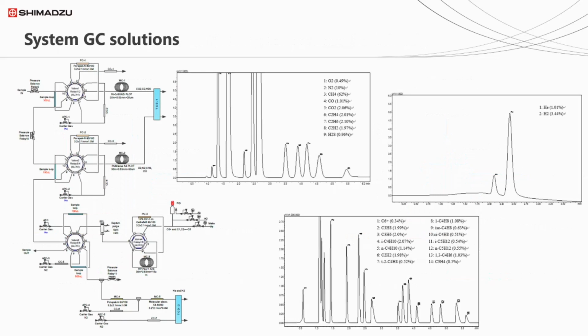If you thought that was complicated, many systems are unfortunately far more complicated than a single valve system. Some can have 2 or even 4 valves to fully separate and analyse the full range of analytes that are required for the method. This is particularly true in the hydrocarbon processing industry, where analytes from hydrogen all the way up to double-digit carbon numbers need to be quantified in a single analysis. Here's an example of a pretty extreme system that has 4 valves, 8 columns and 3 detectors. It generates 3 separate chromatograms in a single run, separating ultravolatiles like helium from hydrogen, right up to hexane.